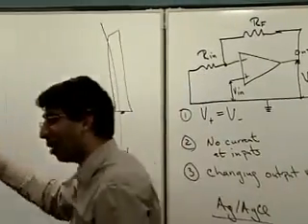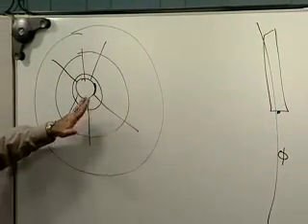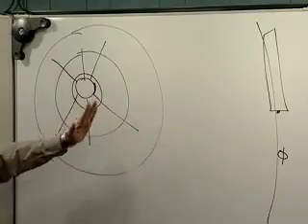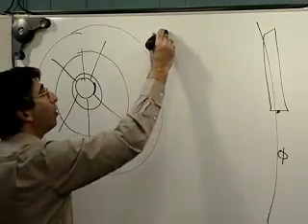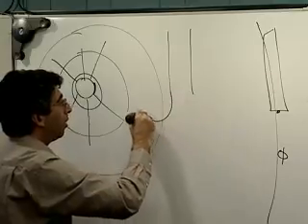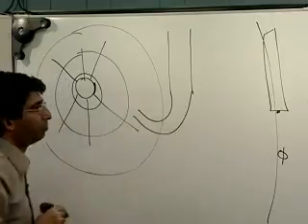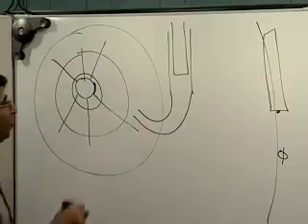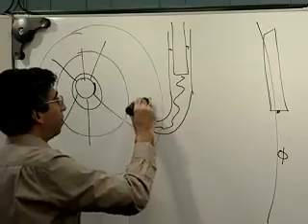So I've already argued that you would like to get your reference electrode as close to your working electrode as possible. That is, you'd like to cut one of these potential surfaces when you dump it in there that's close to the potential of the electrode. But another thing you can do is make a so-called Luggin capillary, where you start off with a wide bore tube and you draw it down to a capillary. That's a J-shaped device. And so you put your reference electrode right in there. Just insert it right down that tube. And this is all filled now with supporting electrolyte. And you have a capillary at the end.